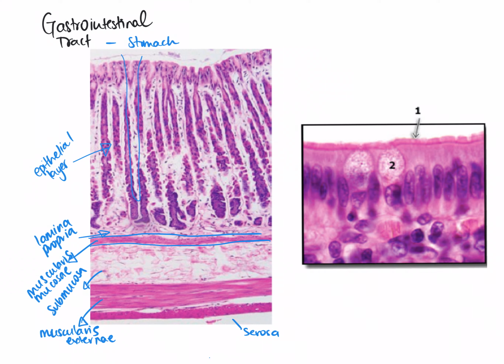So Daniela, what image do we have on the right then? Great question, Vidya. So over here on the right, we are looking at the small intestine, and it's really difficult to distinguish that when comparing it to the left because this image is taken at a much higher magnification. But the identifying feature of this is this border here of microvilli. So there's a whole villus that sits underneath here, and these tall columnar epithelial cells. So we're looking at epithelium here.